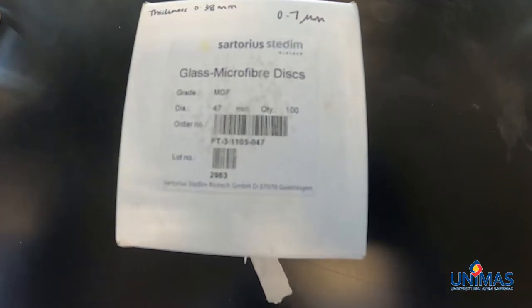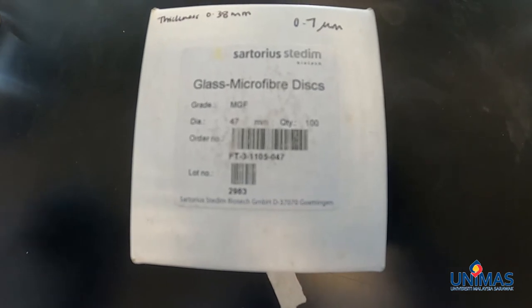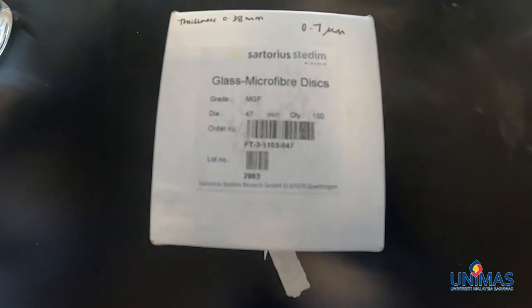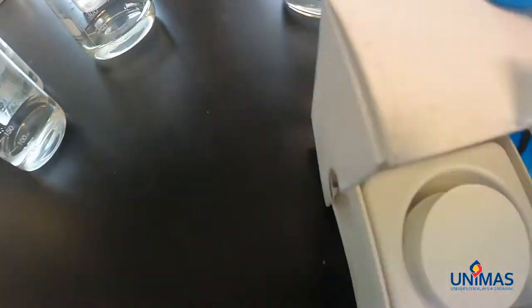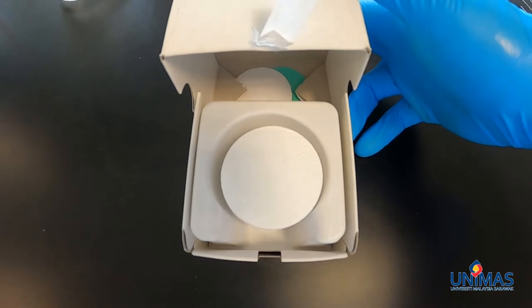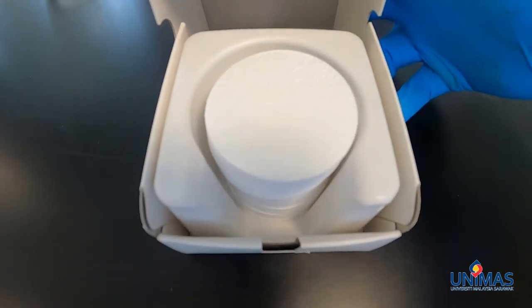We are using the Sartorius Dedim glass microfiber disc, which has a pore size of 0.7 micron, a thickness of 0.38 mm, and a diameter of 47 mm. As you can see here as we open up the box, this is how the disc looks like. We are going to place this into the oven before we start using it for filtration.